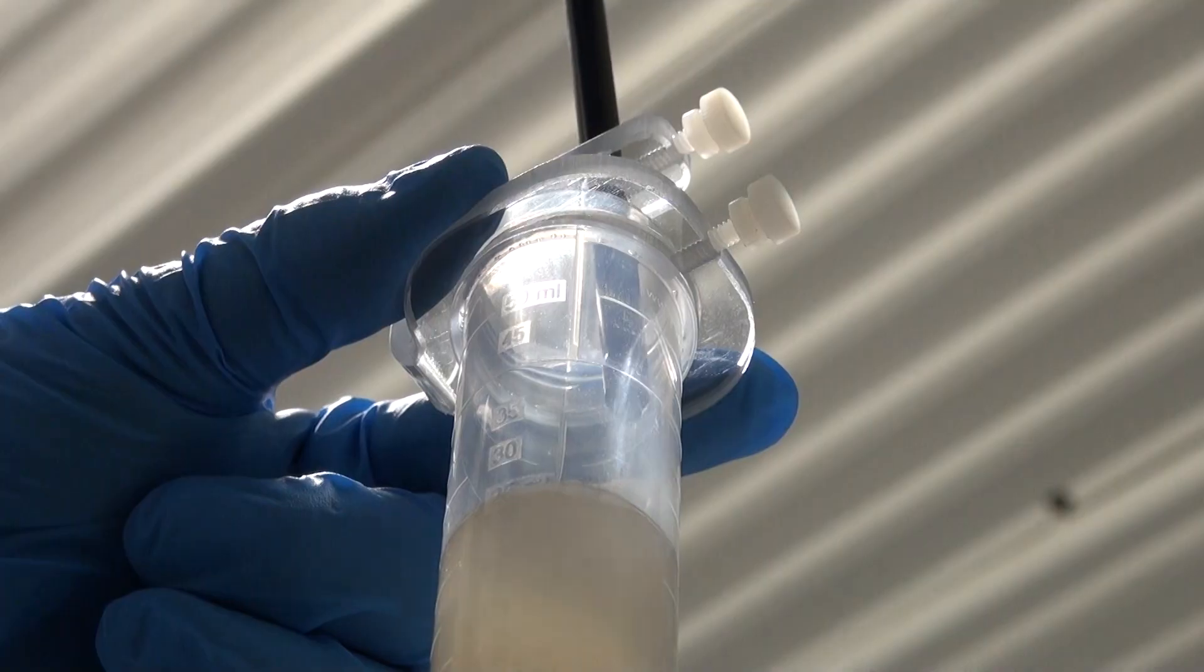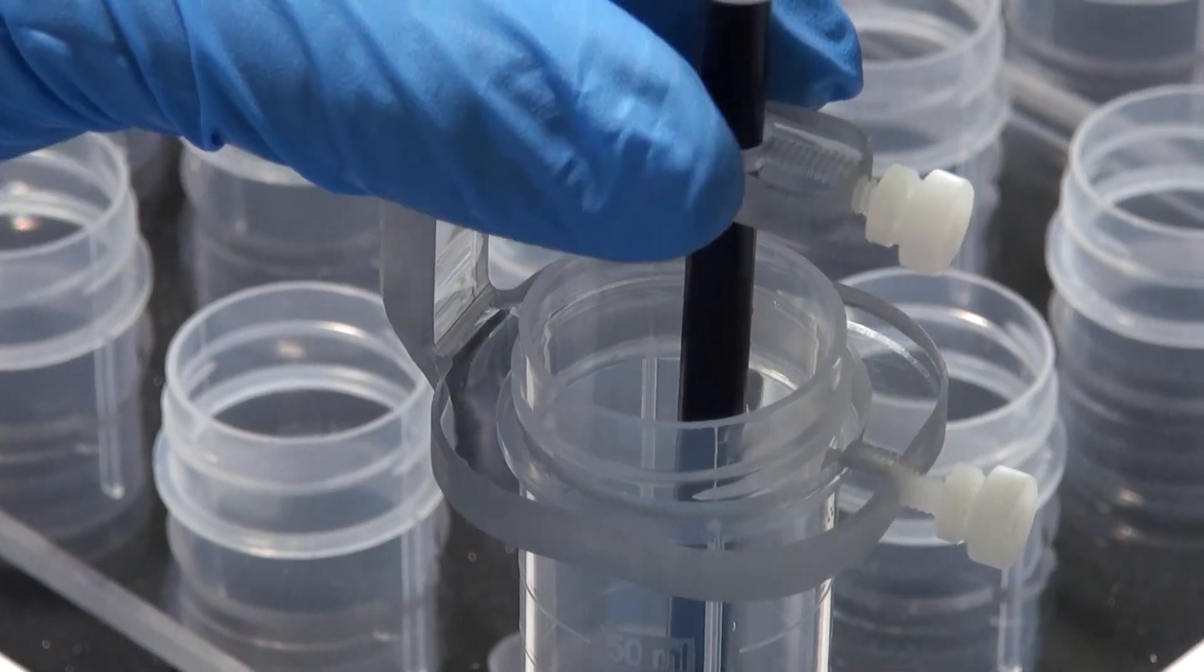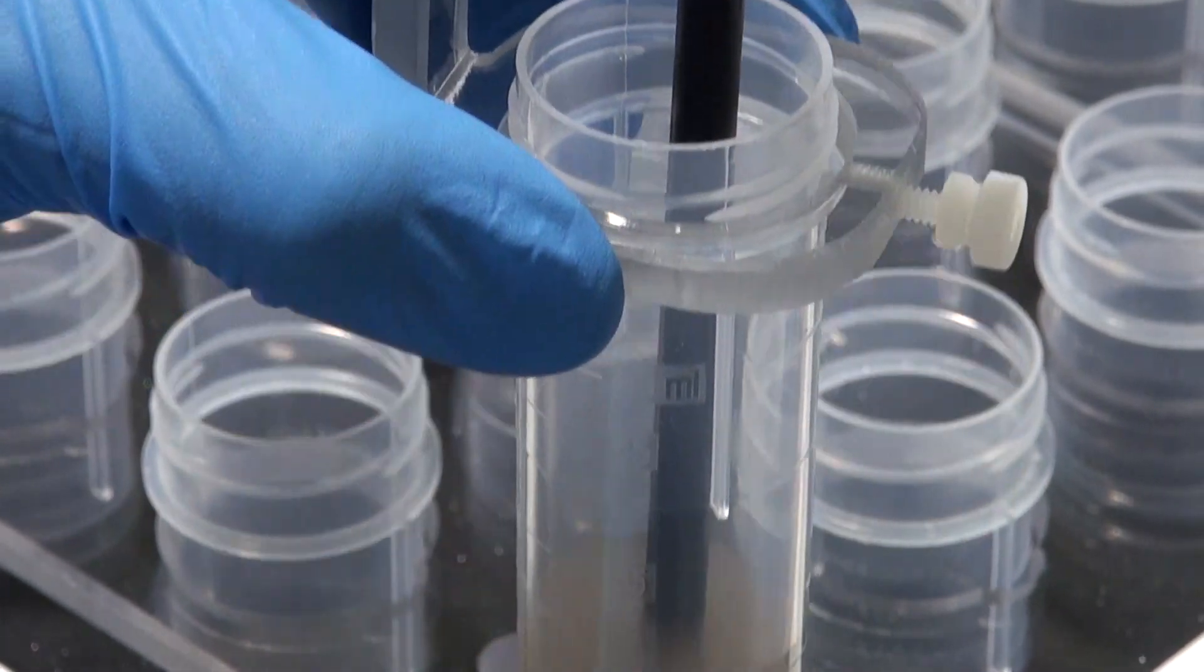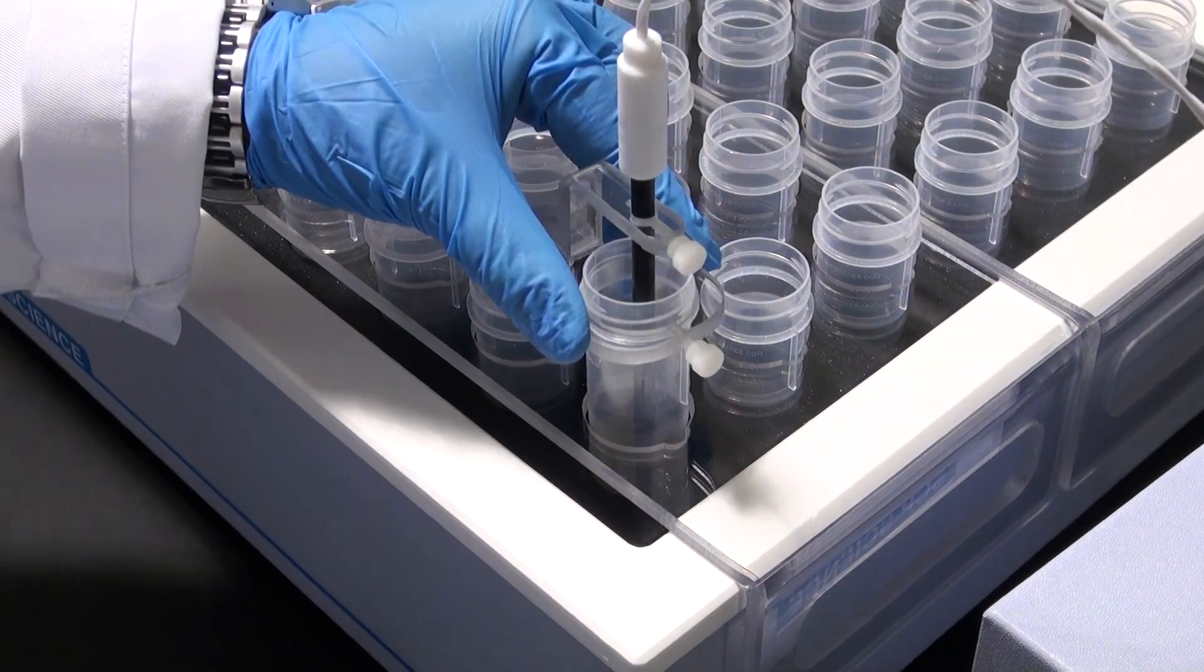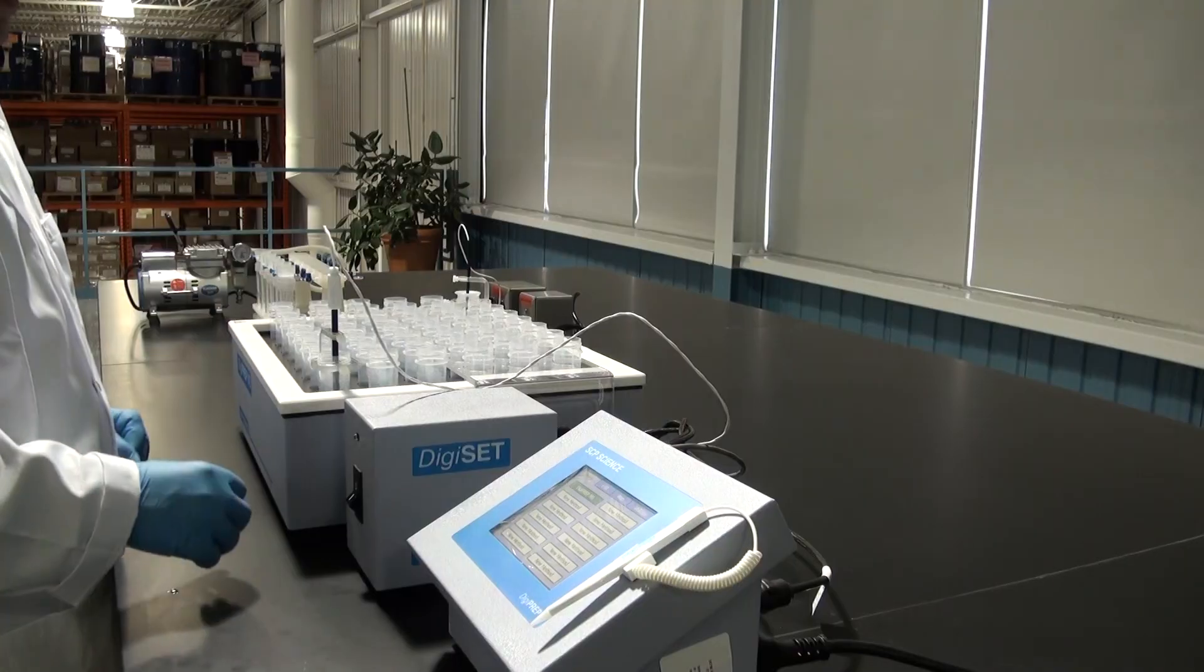This accessory minimizes the need for lab supervision of the evaporation and can even allow for overnight digestions. A light also serves as a visual alarm when the desired volume is reached.